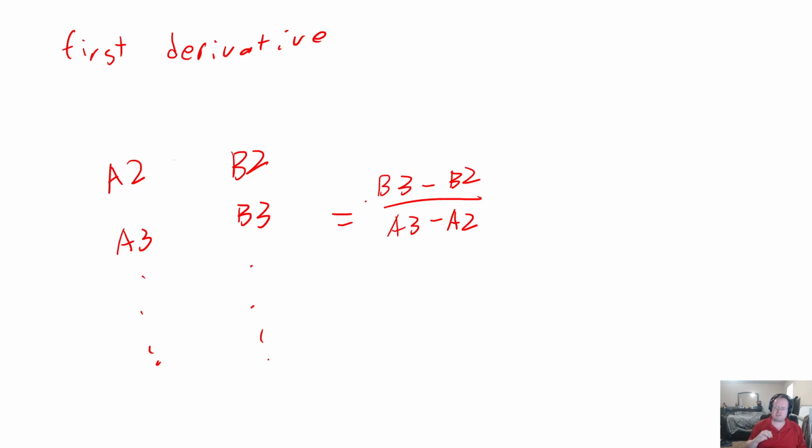The goal of the derivative is to identify where your equivalence point is. The closest point to your endpoint will be the highest value for your first derivative, because that's where the change is going to be happening the fastest. Now, one reason we're doing this is because your points are unevenly distributed. You make volume measurements, and sometimes you add half a milliliter. Other times you add a tenth of a milliliter or 2/10 of a milliliter. By looking at the first derivative, we can account for that, because I can't always just look at the difference and tell. Sometimes when I look at the difference, there might be 2 points that look really close together. It could be either of them, and this accounts for that.